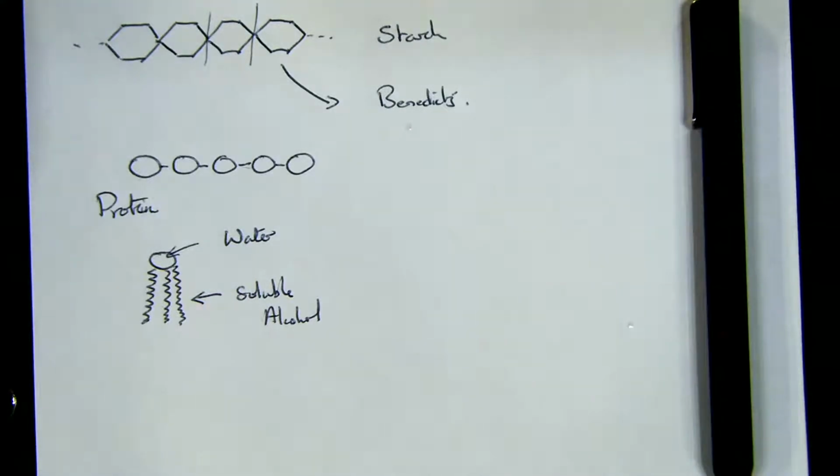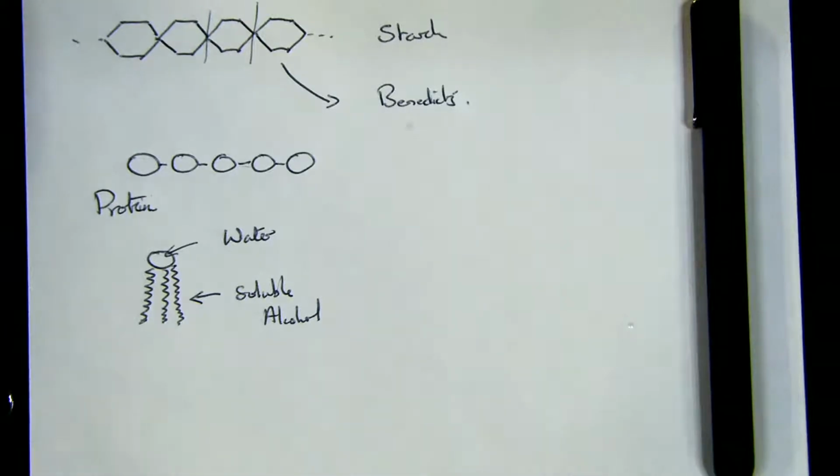Now, of course, we need to have particular rules on how we're going to do some of these tests, and we'll have a look at those now.